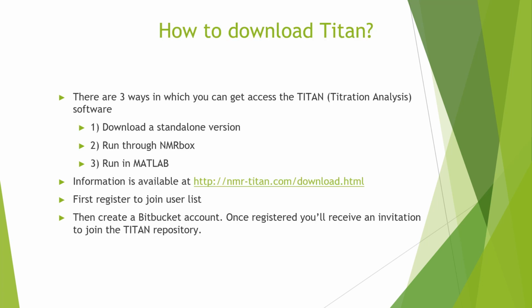There are 3 ways in which you can get access to TITAN software. 1. Download a standalone version. 2. Run through NMR Box. Or 3. Run in MATLAB. The information is in the link on the slide.